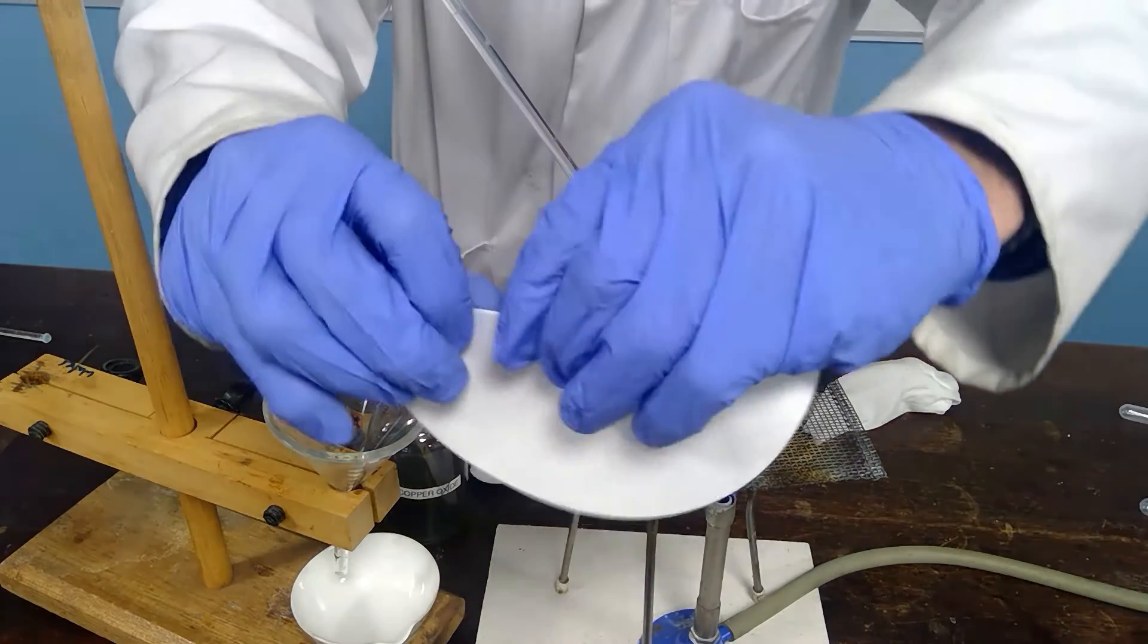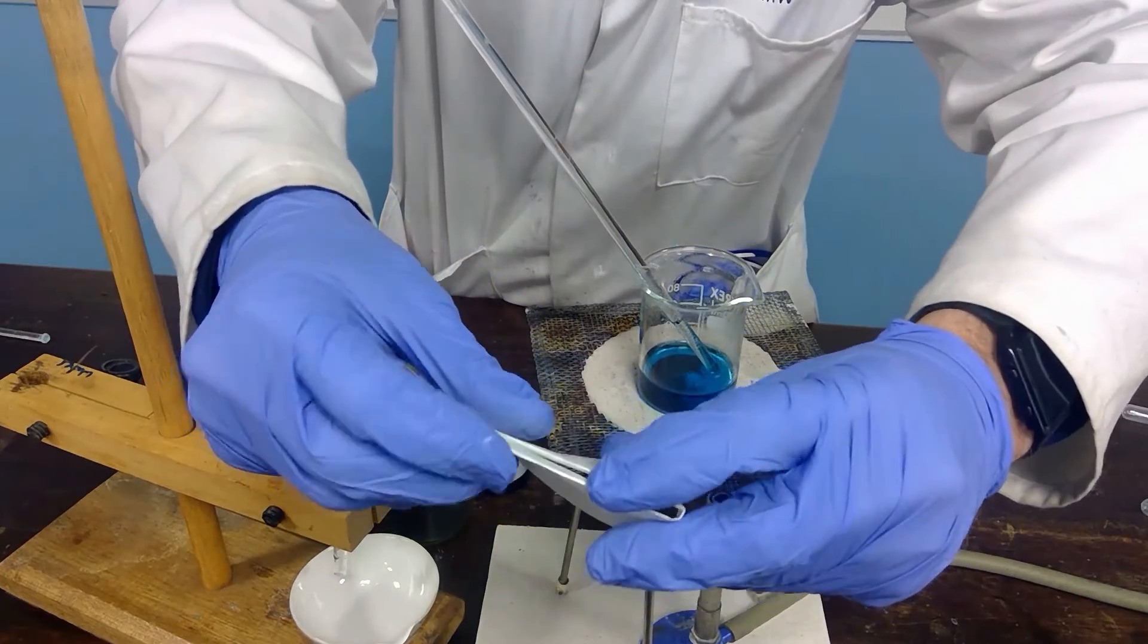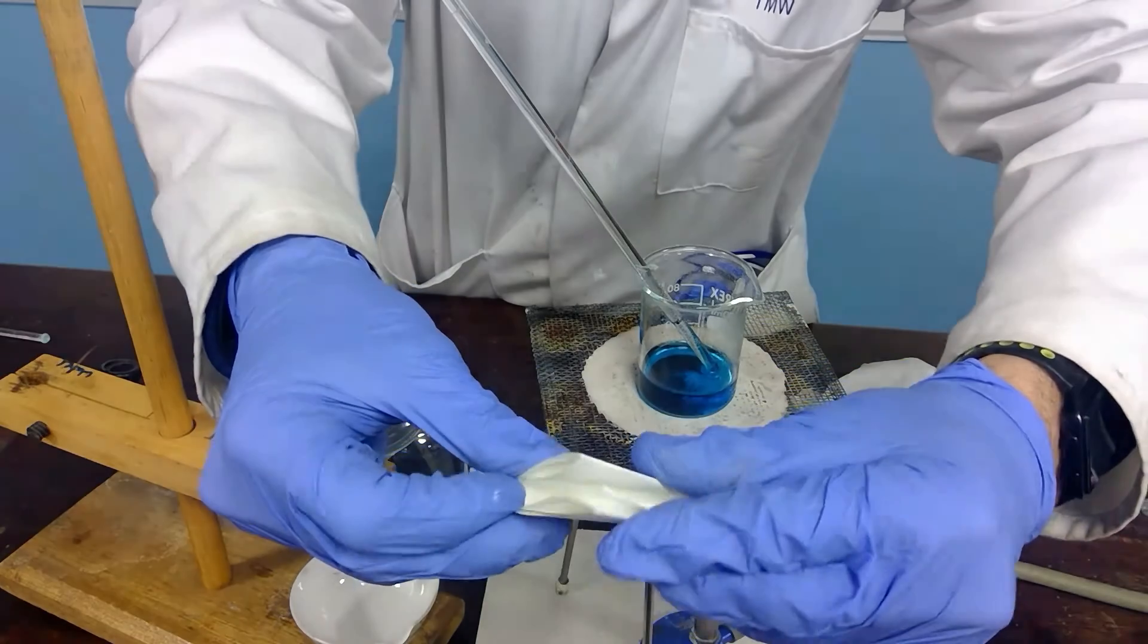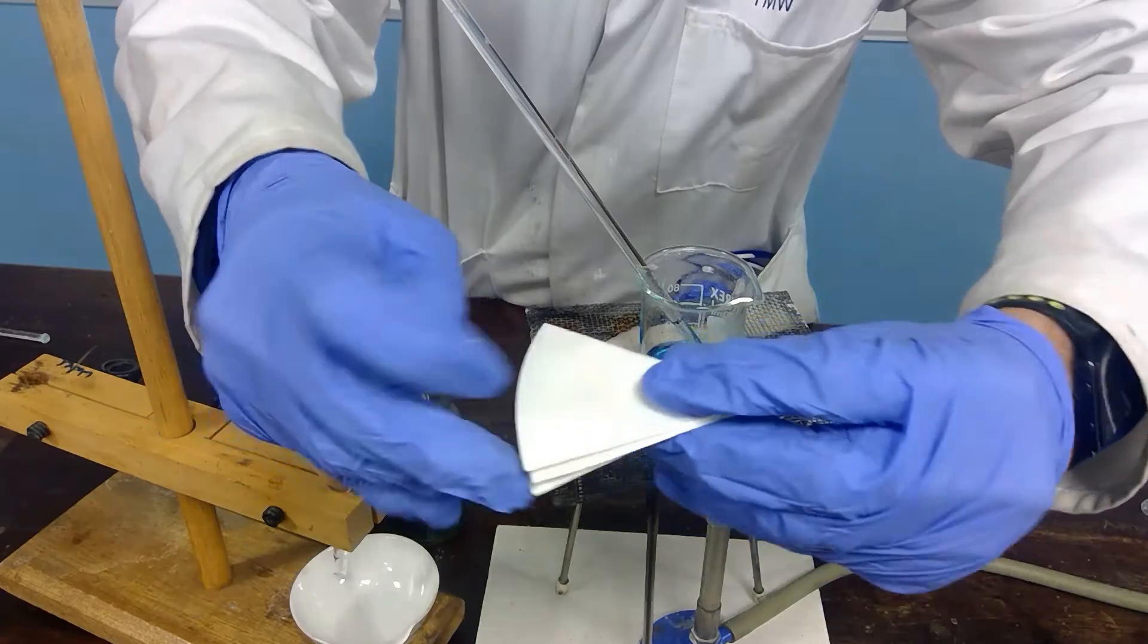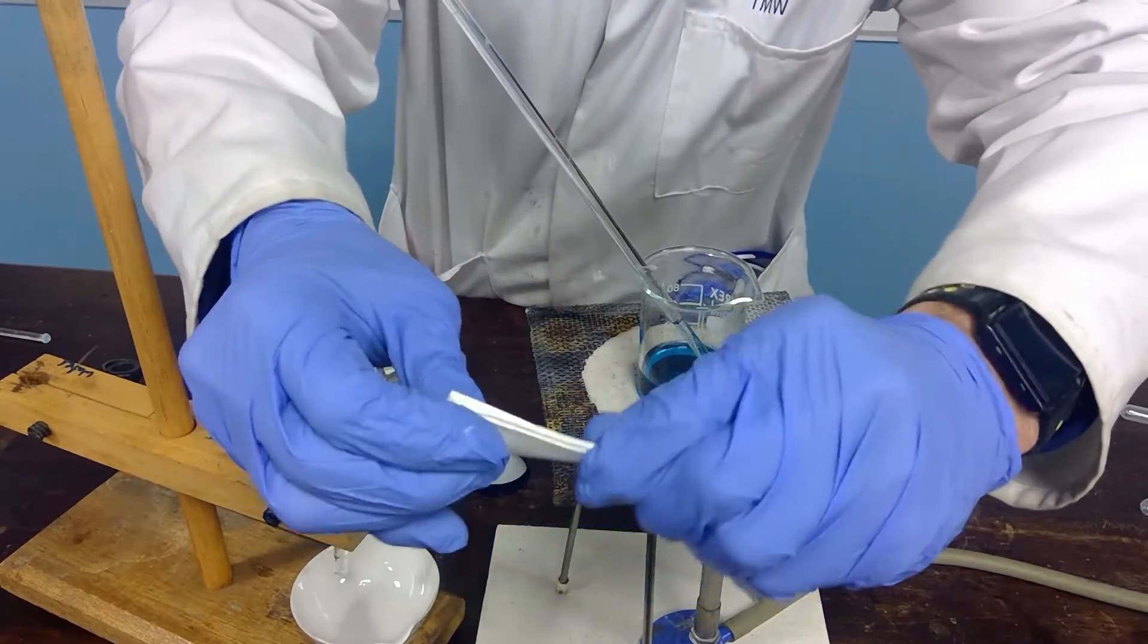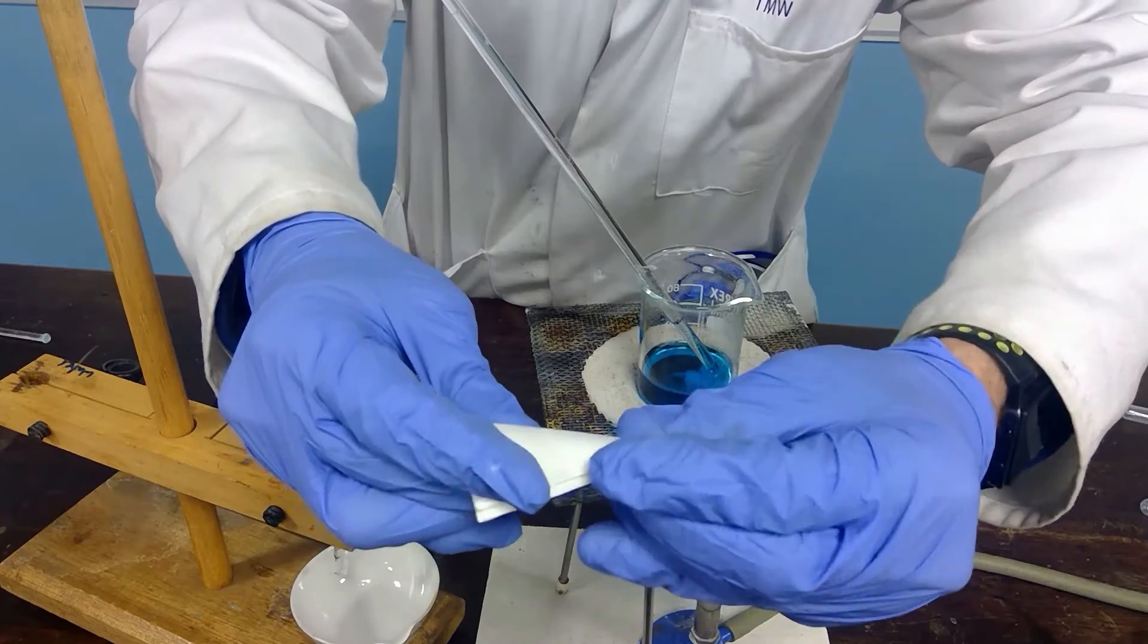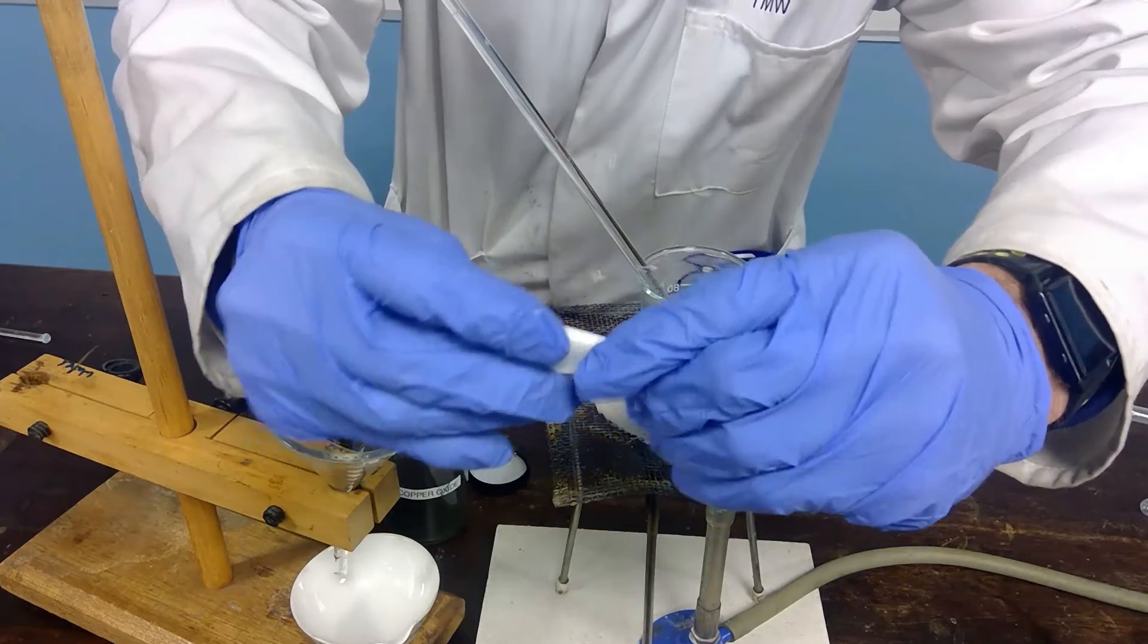To make fluted filter paper you fold once, twice, three times and a fourth time. On the fourth fold you make sure that the folds can move in either direction by turning it back on itself and refolding it in the opposite direction.